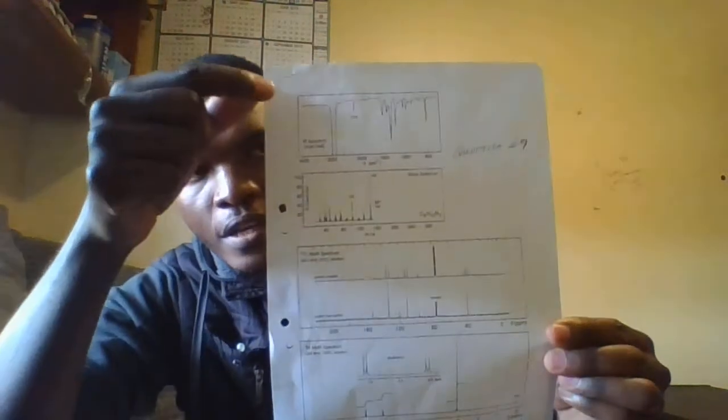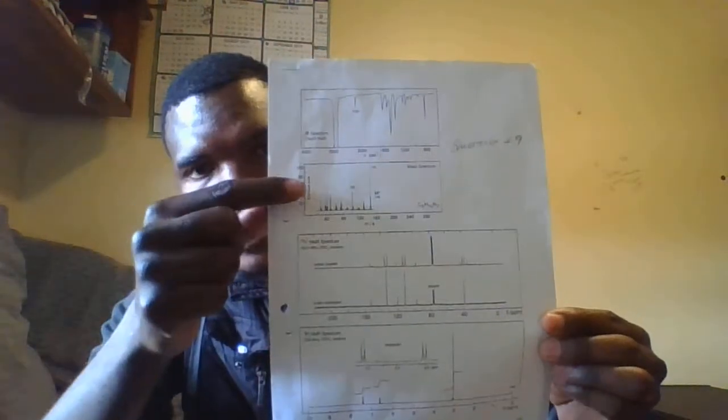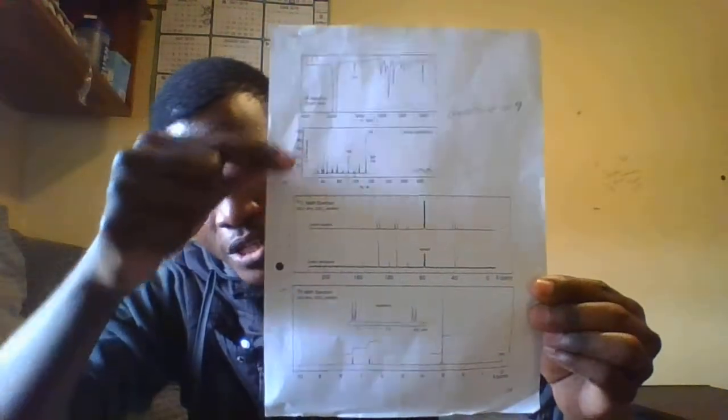We have the infrared information, the mass spectrometer information, the carbon NMR information, and the hydrogen NMR information. I try to magnify the information. I'm going to show you what's on that question paper, then we take it from there.